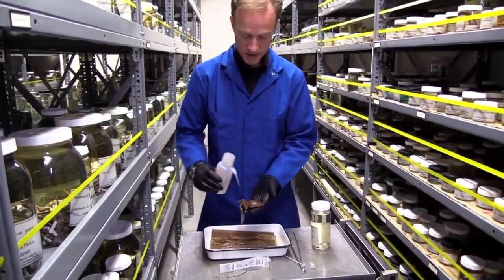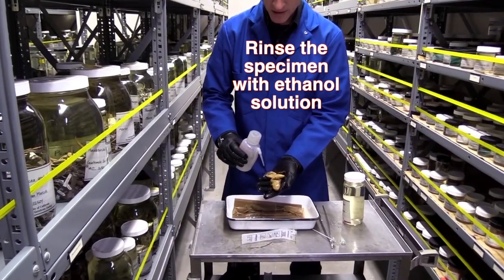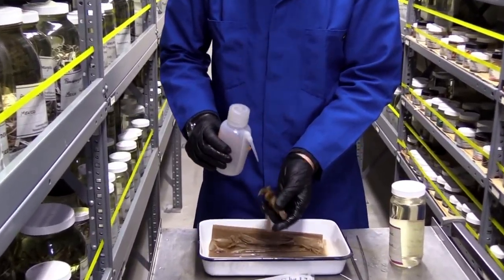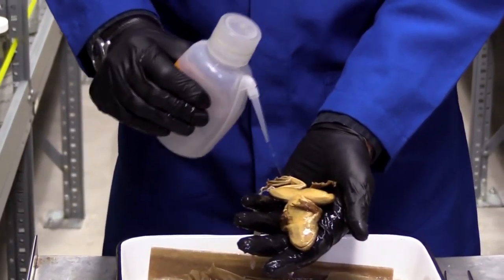The first thing I want to do is rinse it to make sure that there's nothing just stuck on there that could give us a false positive. So I rinse it off with ethanol, spraying pretty hard to rinse it as best I can.